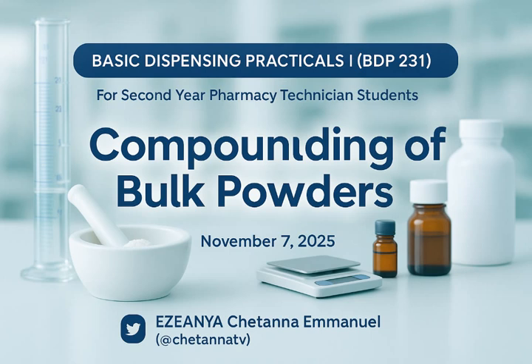Now let me ask you. Let me know, those that think deeply. If you weigh 12.5 grams of zinc oxide, weigh 12.5 grams of starch, weigh purified talc BP 25 grams and mix everything, then if you want to package it, do you think you can get 50 grams of the entire product?